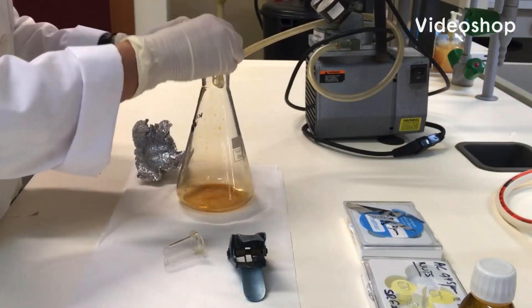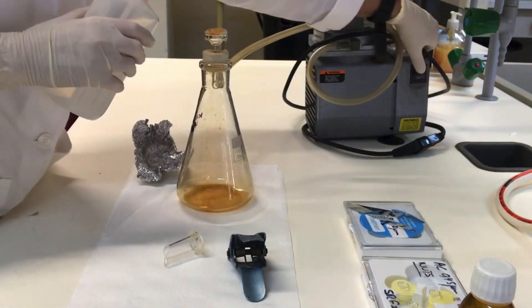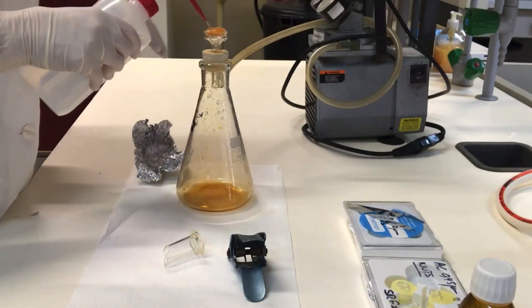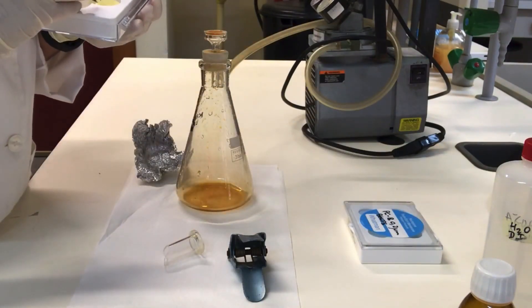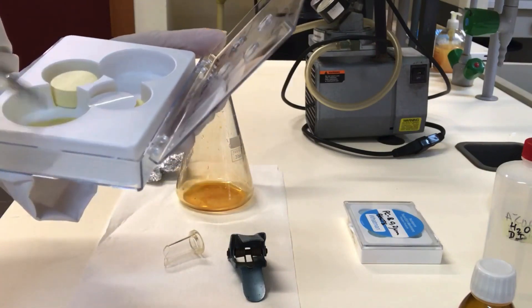Prepare the filtration system. Turn on the vacuum pump and rinse the filtration system with sterile water. Then place the backing filter on the filter base — it doesn't matter which side is up — and wet the filter with sterile water.